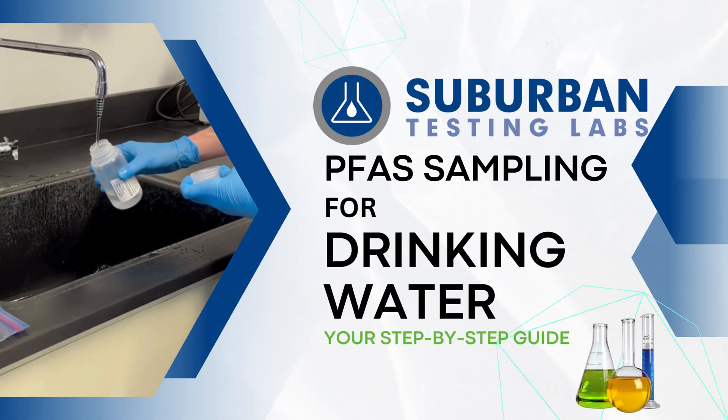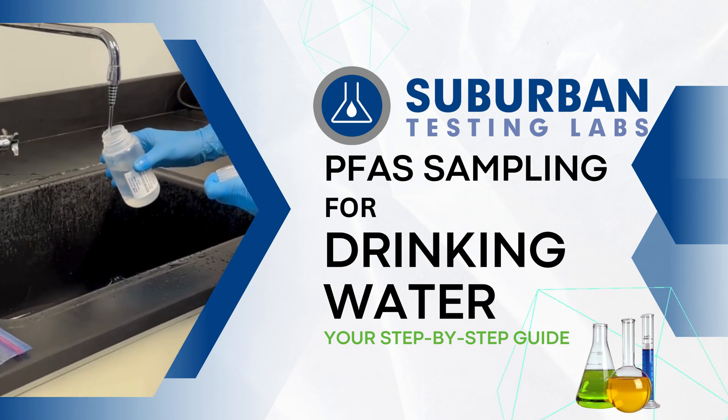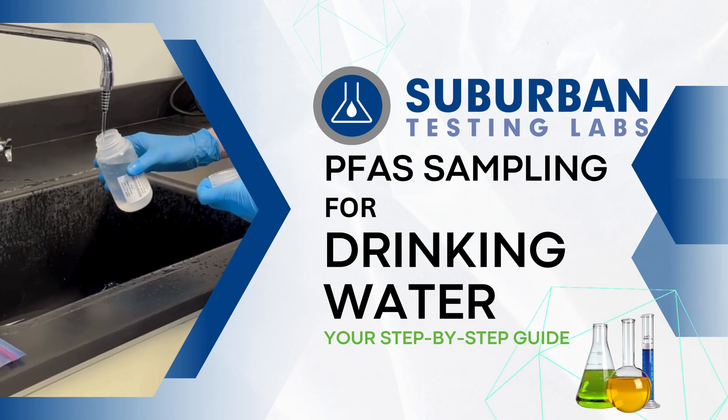Hello and welcome to Suburban Academy. In this video we will review a step-by-step guide on how to sample for PFAS in drinking water.